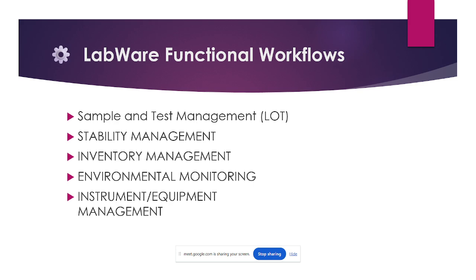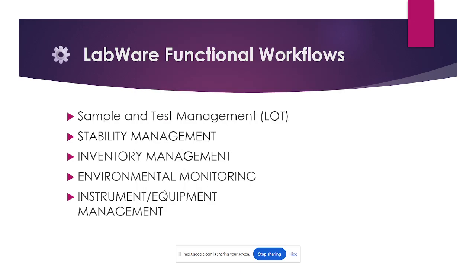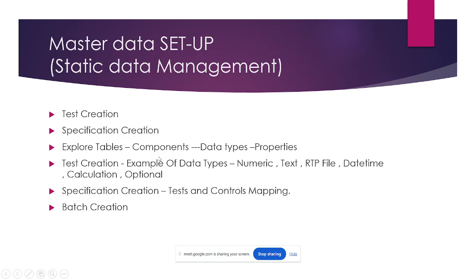Okay, in the Labware functional workflows, there will be stability management, sample and test management, inventory management, environmental monitoring, and instrument and equipment management. These are the modules that will be useful in the functional workflows. And coming to the master data setup.